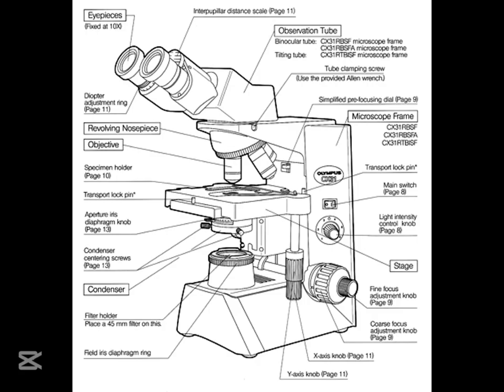But remember, microscopes aren't just about quizzes. They're about unlocking new discoveries and understanding the world around us. You're right. It's about using what we've learned to explore and learn even more. Any tips for getting the most out of using a microscope? Be patient and observant. Don't just glance at the specimen. Really take your time. Move the slide around, adjust the focus, and really look at the details. You never know what you might find.